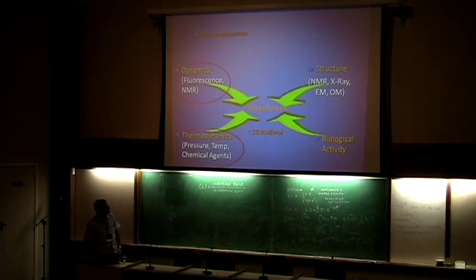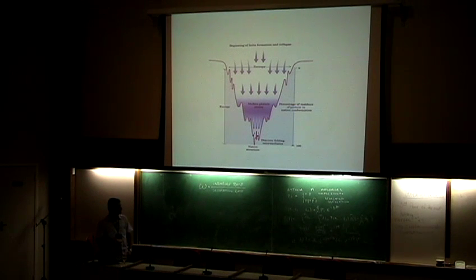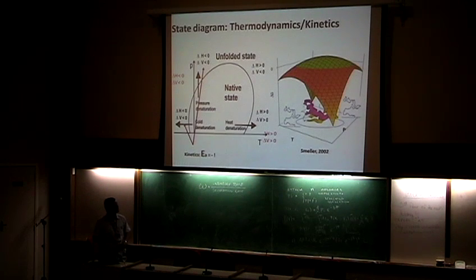So, in the second part of my talk, I want to explore a little bit more why, especially when the system starts to get a little more complicated, and one can say you start to have more roughness in the landscape or a more complex landscape, it's quite important to extend your experimental axis to the pressure window. So that's just a curve, I think Daniel also mentioned yesterday.